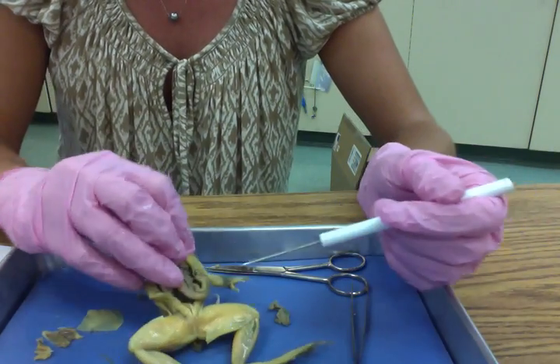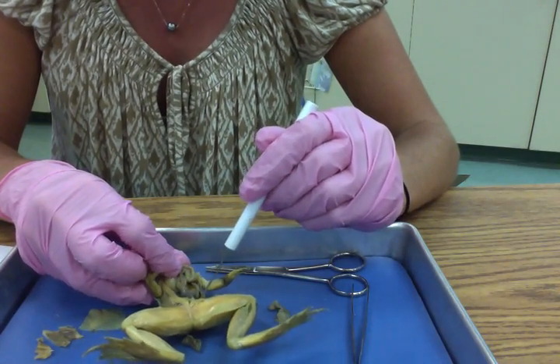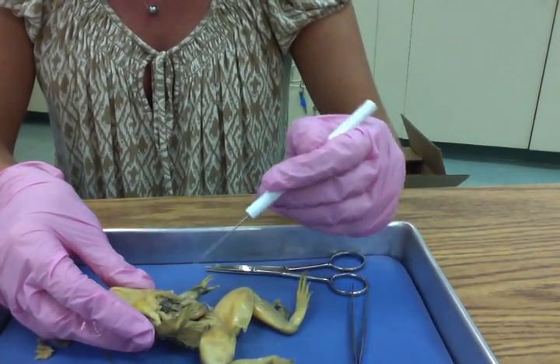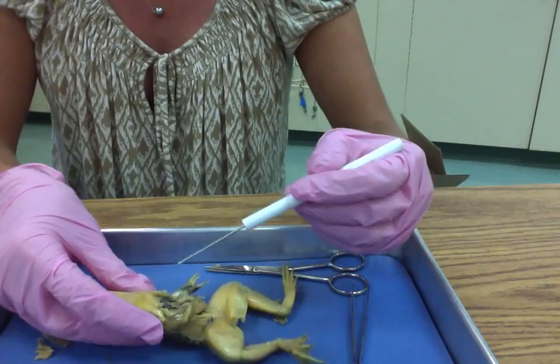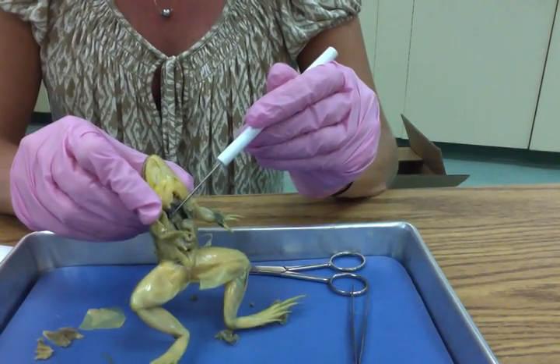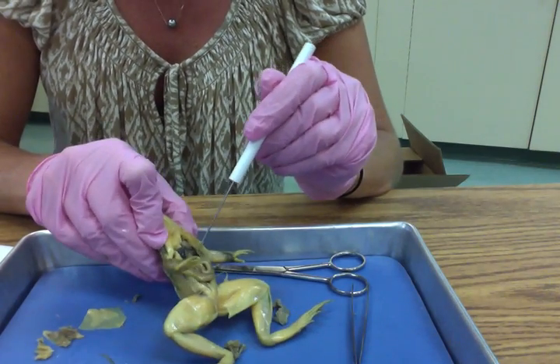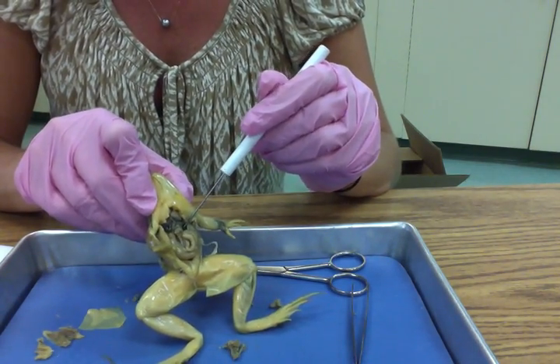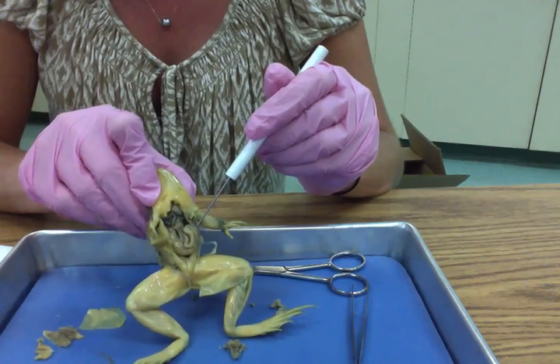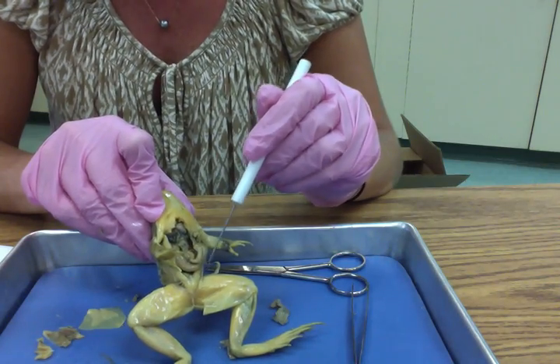Now, your job is to draw the internal anatomy of a frog. So you're going to want to draw what you see, and you are responsible for labeling the liver, which is that first thing that we took out, the heart, the gallbladder, which was under the liver, both lungs, the fat body or bodies if you see more than one, the stomach, small intestine, and large intestine.